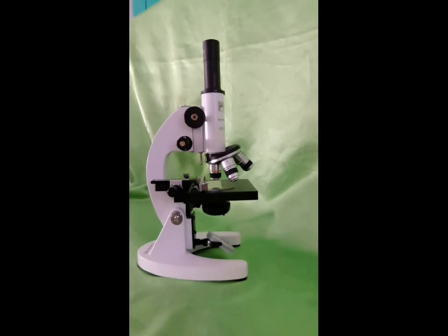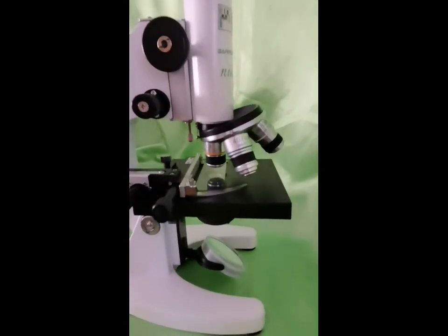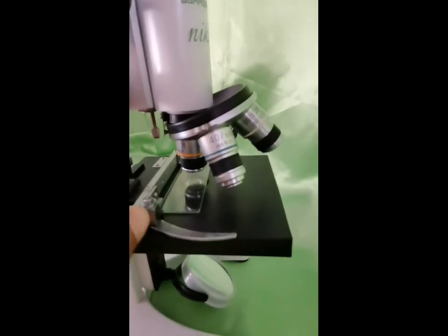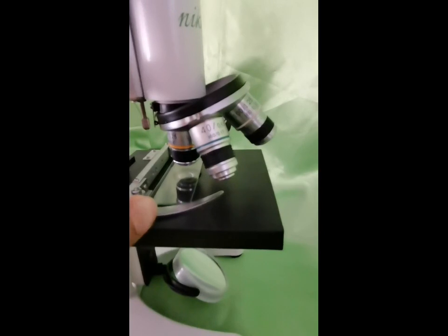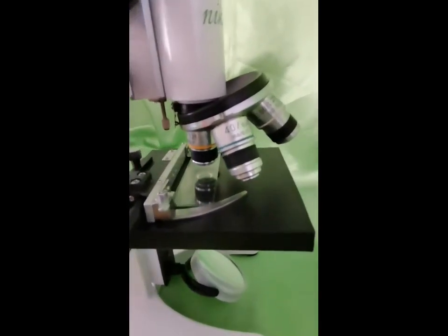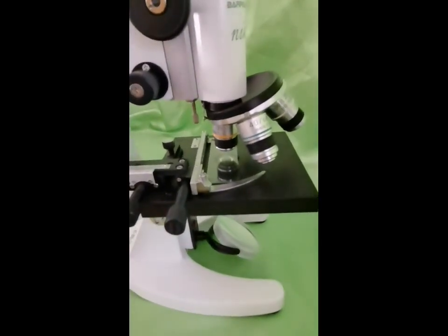And lastly, we have the stage clip. These are 2 metals that clip or connect on the upper part of the stage. They hold the glass slide in place. The glass slide is where the specimen, a sample of any material to be observed, is mounted.